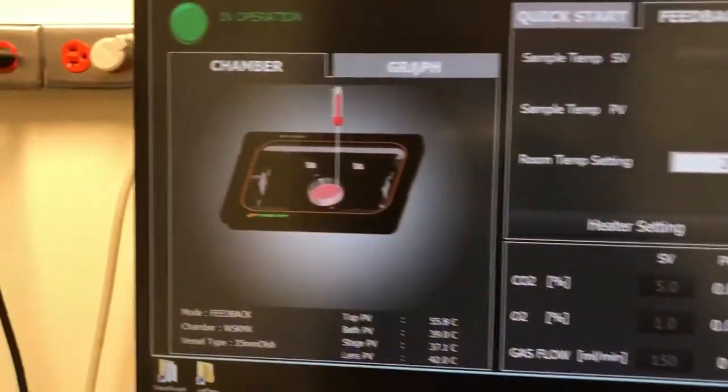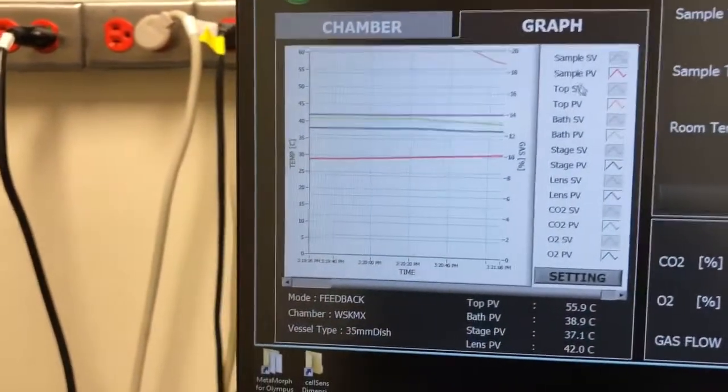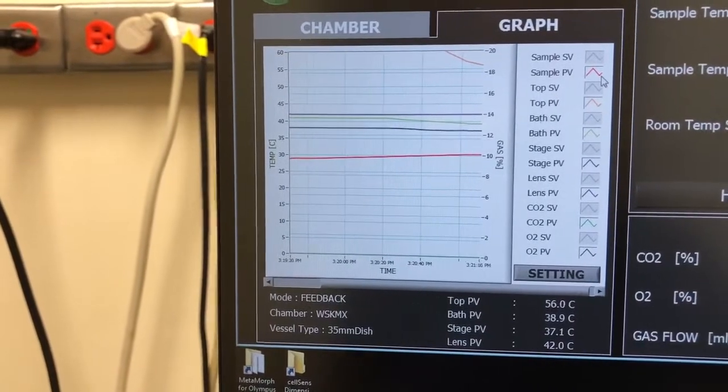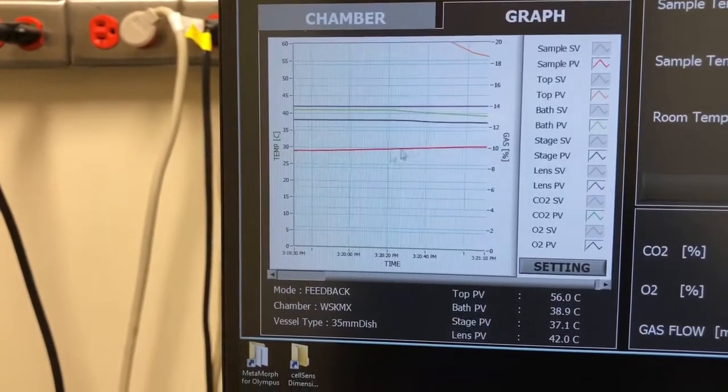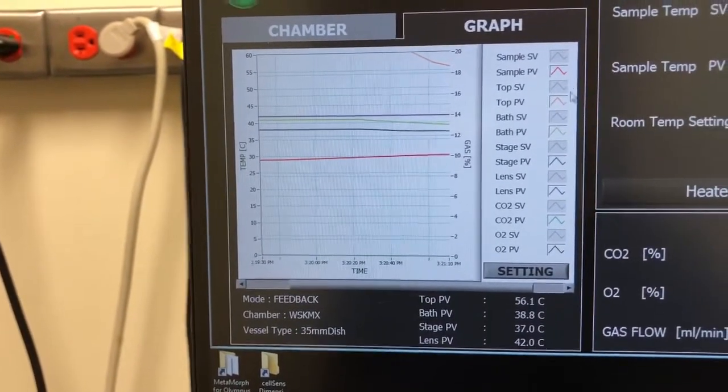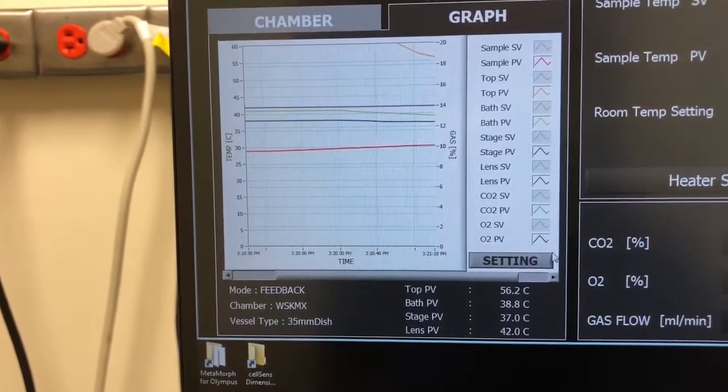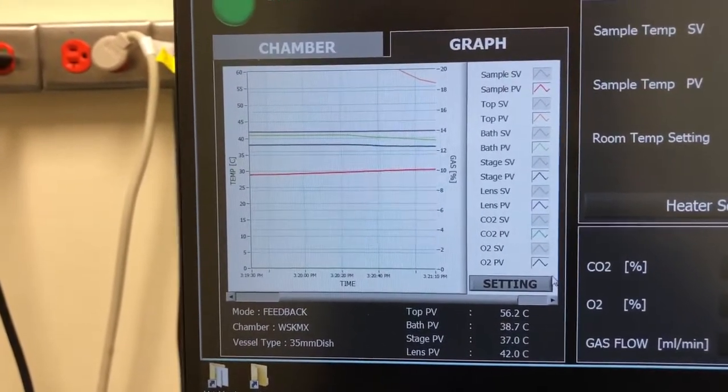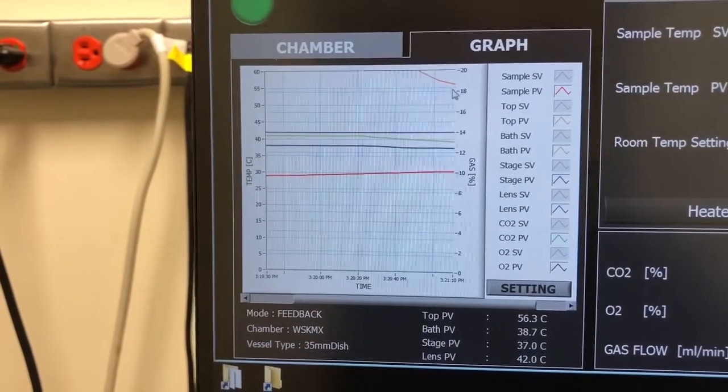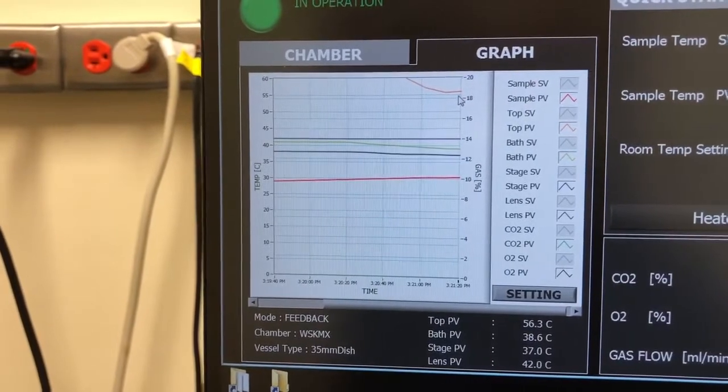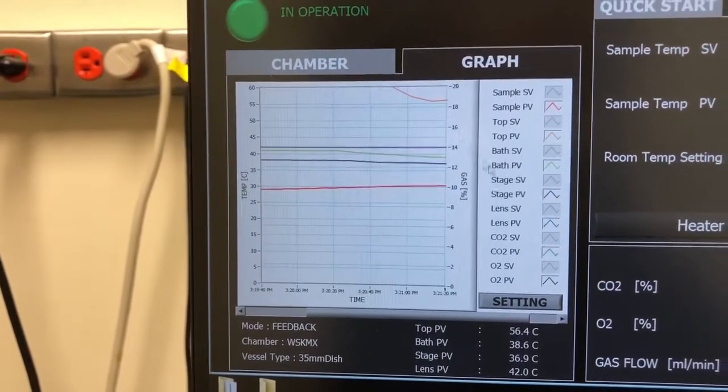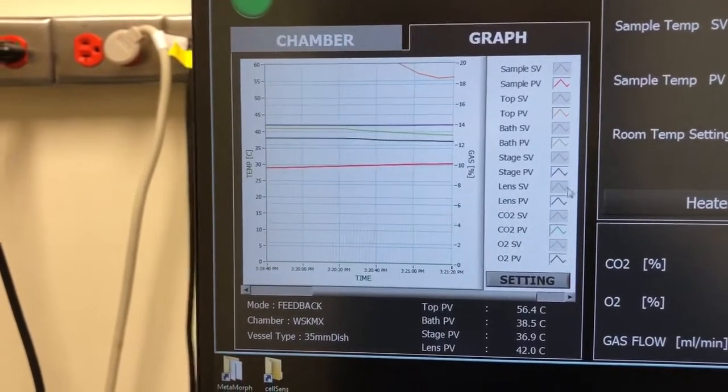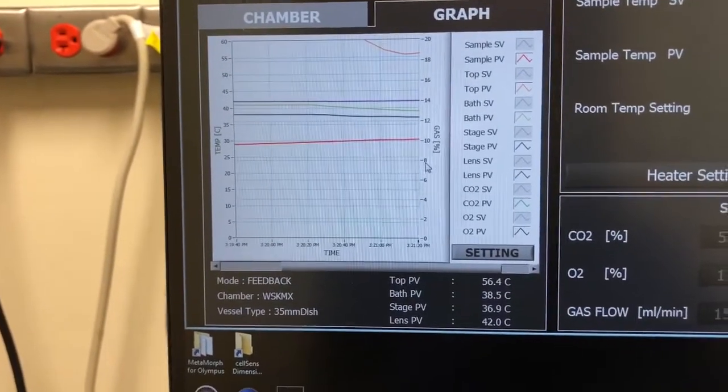And then in this graph, we have various things. We have the sample actual temperature, which is this one. And then we have the temperature of a bunch of other things. The sort of the top of the heater, the bath heater, the stage heater, and the lens heater. Here you can see them.